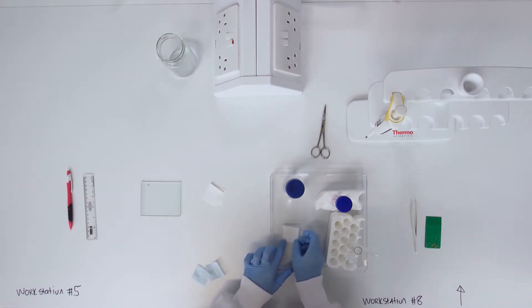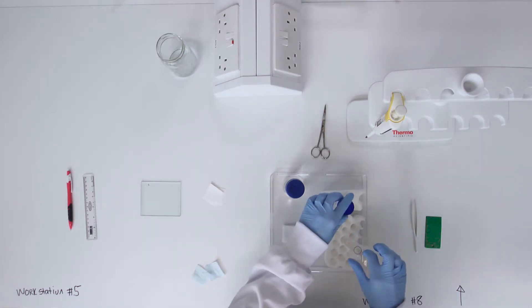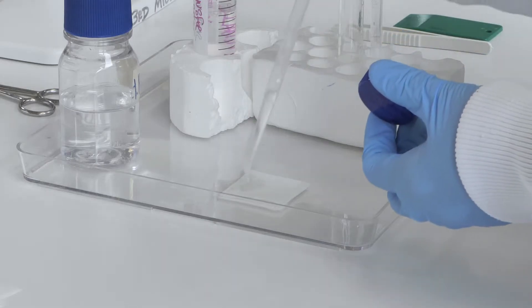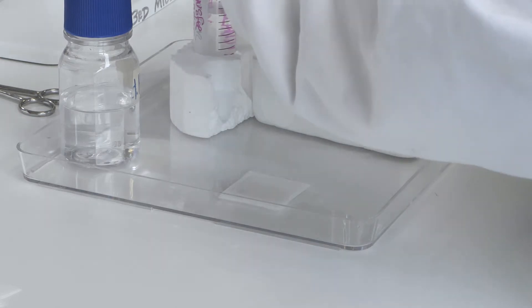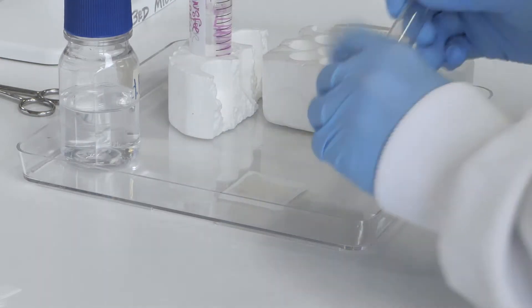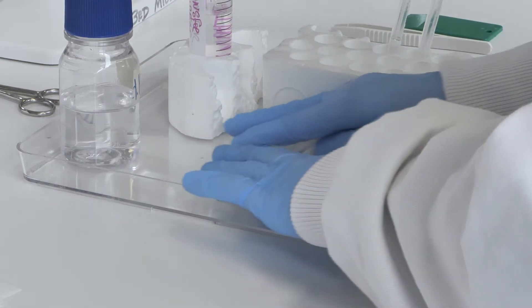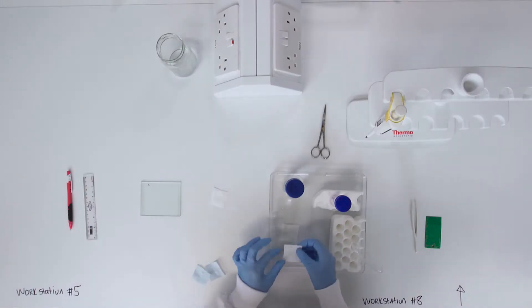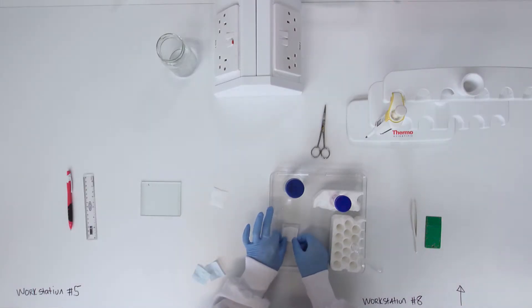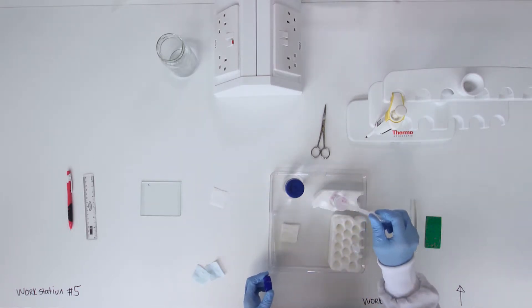Add another sheet of filter paper, wet with transfer buffer and roll out any air bubbles. Add two more sheets of filter paper, again wetting and rolling each. The immunoblot sandwich is now complete.